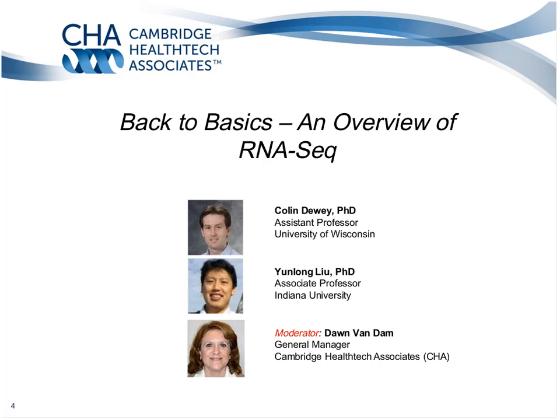So one thing I would say is to look at how your reads, your actual data, are aligning back to the transcripts that are assembled, and see that your transcriptome is explaining the actual data that you have. To that end, our group is developing a method for evaluating some of these de novo assemblers. So be on the lookout for a method called RSEM-EVAL soon, which will allow you to evaluate a given assembly given the reads that you used to assemble it.